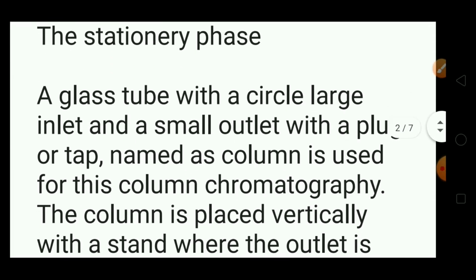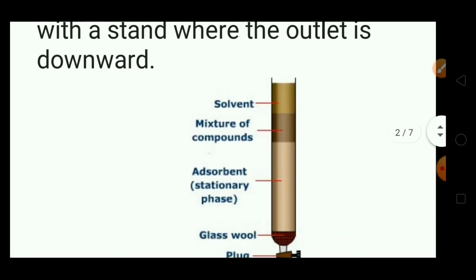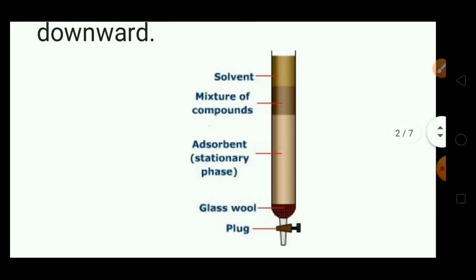Explanation. Firstly, you need to see this diagram. It is a large circle inlet. It is the outlet.